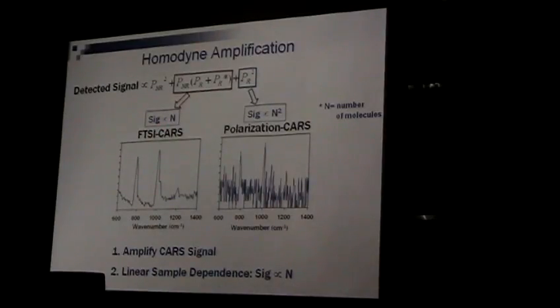So it has linear concentration dependence. What it means is, say I can detect 10 millimolar of something now. If I want to detect 1 millimolar sample, in this way you have to be 1,000 times better. In this way, just 10 times better. If somebody asks me to make my system 1,000,000 times better, I basically give up. I probably don't even look at it. 1,000,000 times is not easy. But if somebody says, what about 100 times, then maybe okay. So this is a big difference, right?